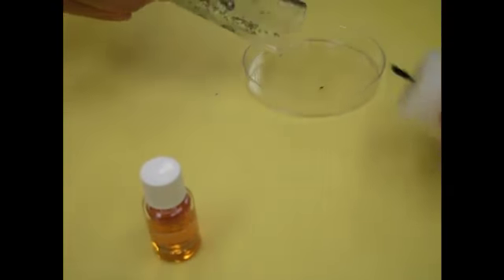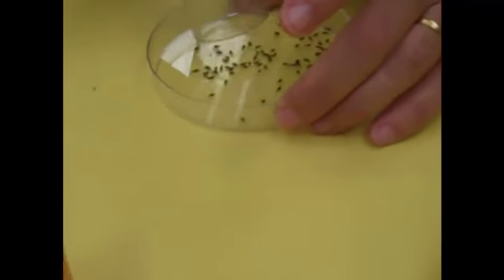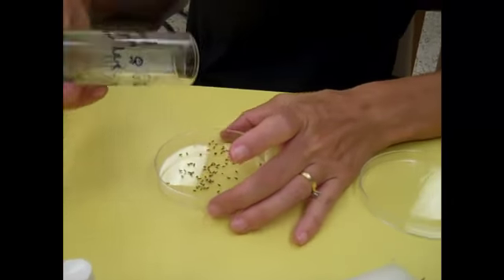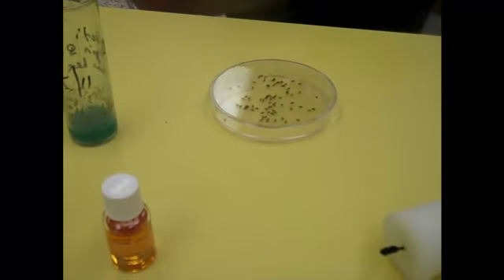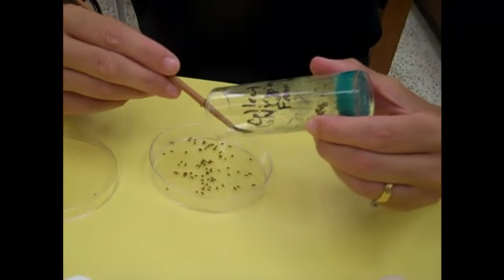And I'm going to try to flip these guys into this petri dish. Okay. And if you've got some stubborn ones clinging to the sides of the wall of the vial, sorry, I should have had this on the table, you can get a little paintbrush and kind of brush them out with that so they're not in there.